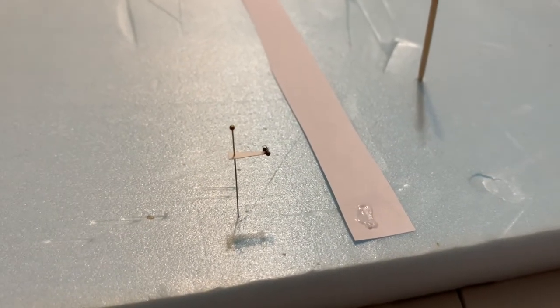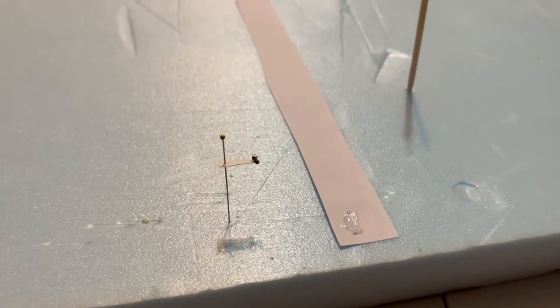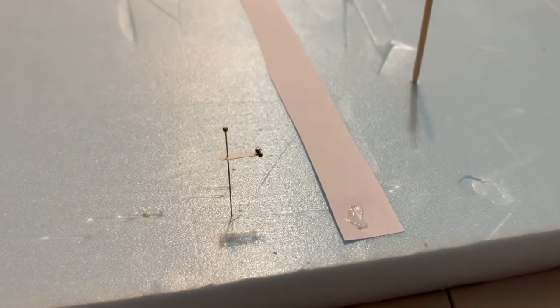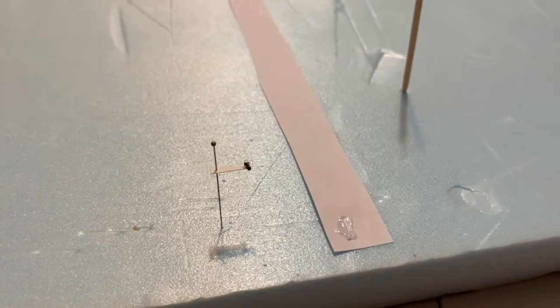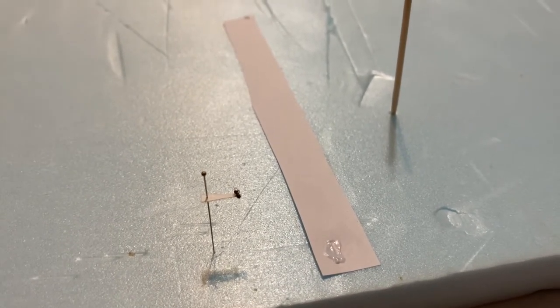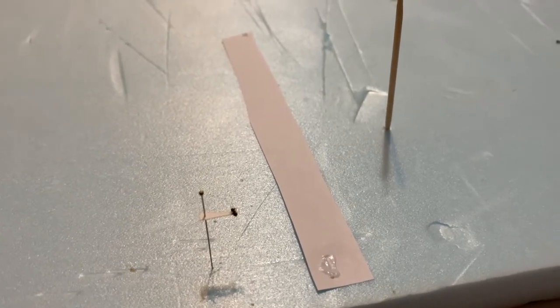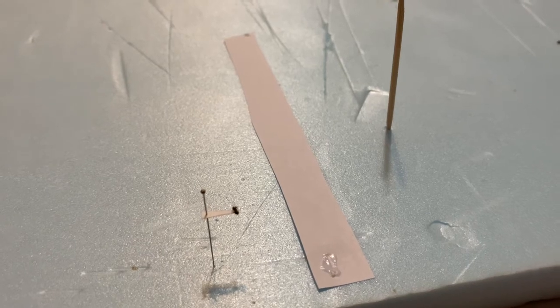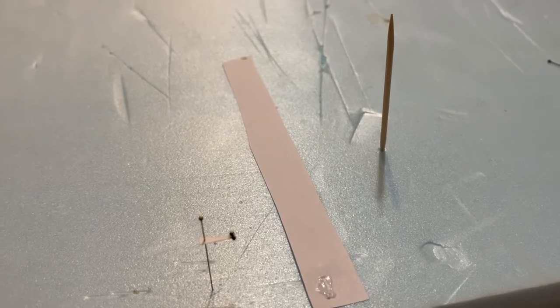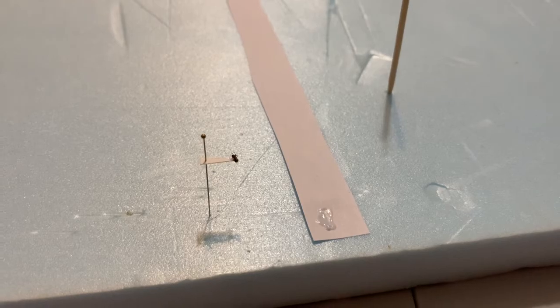Another alternative to pointing insects is placing them in ethanol. It's kind of up to your own discretion what you want to do. Although placing insects in ethanol can start to take up a lot of space in your collection, as each insect should be in its own vial unless they're the same species collected at the same time and location. And as a last point, you should never place moths in ethanol because this will remove all the scales from the wings. All right, so that is how to point an insect.